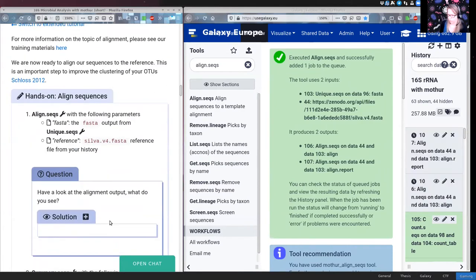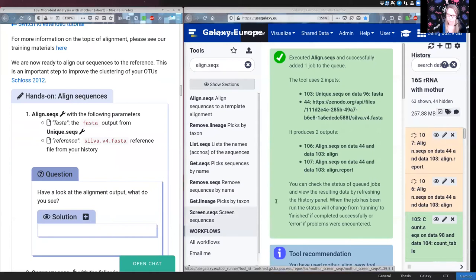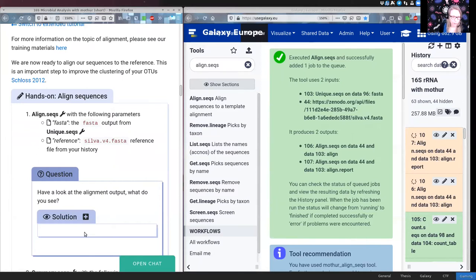This tool will take each read and try to align it to the best place in the Silva reference. We can use this for further cleaning — if a read does not map to the V4 region as expected, it is not very useful and we will throw it away. After alignment we can look at where things lined up and see how well they align. This might take a few minutes.